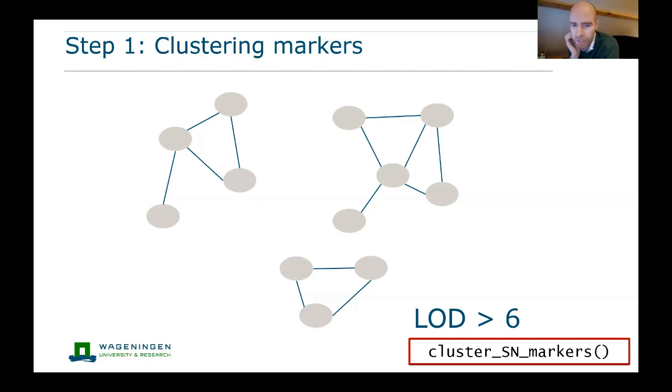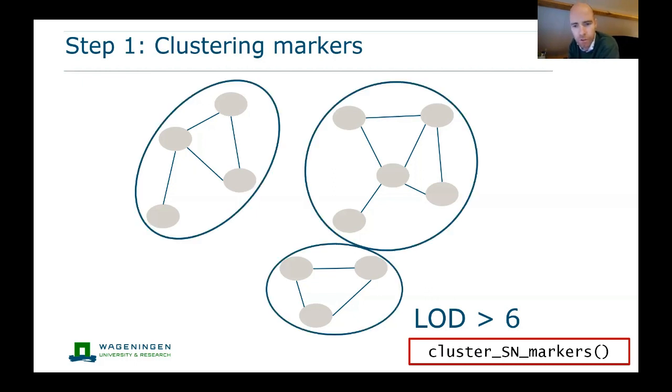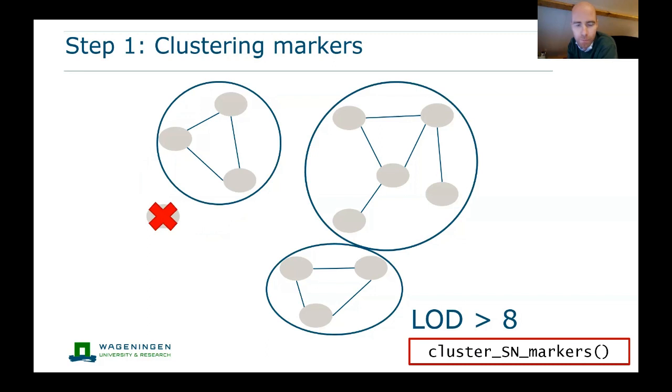So we took the same philosophy as is used by JoinMap, which looks at how your markers cluster over a range of different LOD scores. And that is quite a good workaround to have a data set specific manner to figure out the structure of your data.